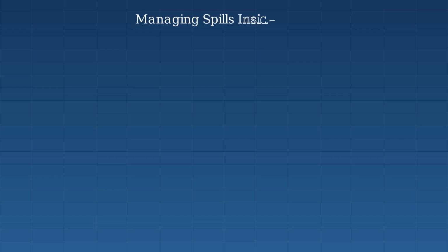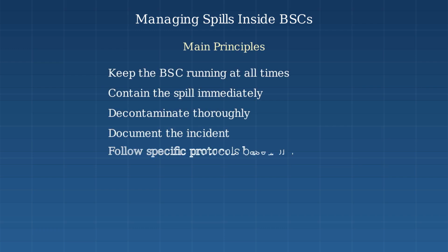Managing spills inside biosafety cabinets requires specific procedures to maintain safety and containment. The main principles of spill management include keeping the cabinet running at all times, containing the spill immediately, decontaminating thoroughly, documenting the incident, and following specific protocols based on the type of spill.